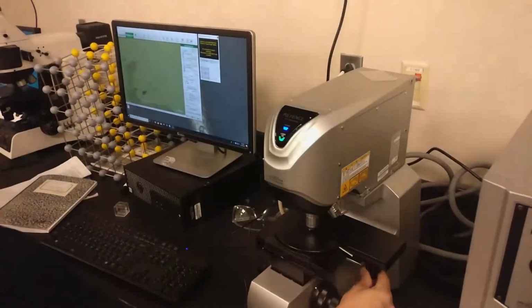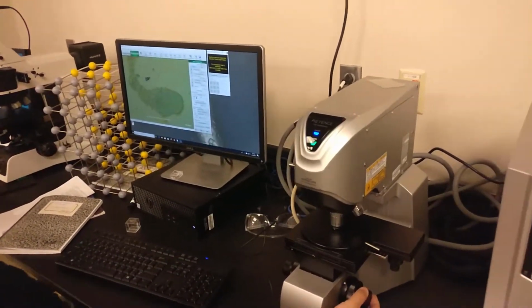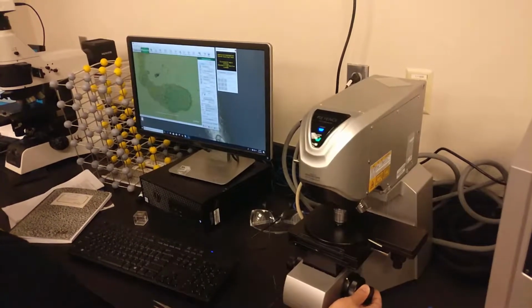Once the sample is on the stage, we use the X and Y knobs to get the sample into view. Then, we use the fine and coarse focus dials to get the sample into focus.